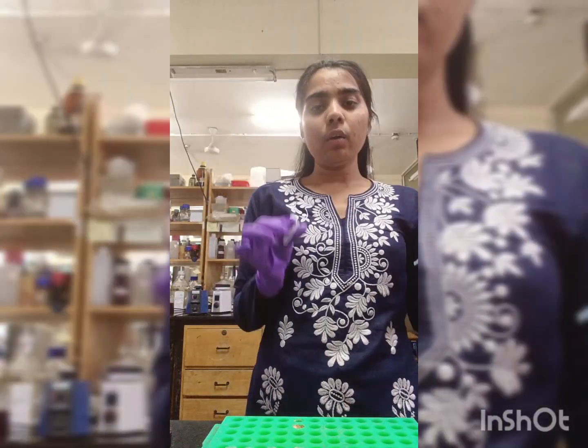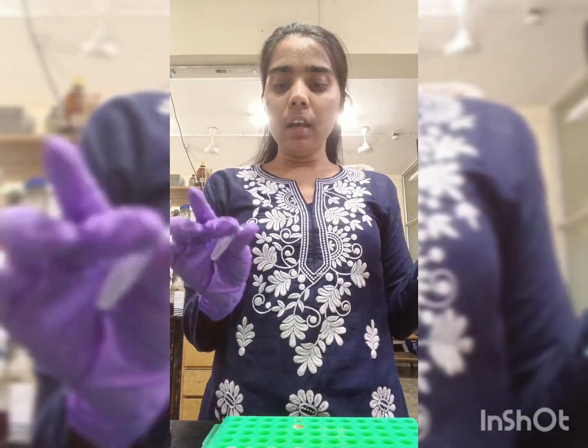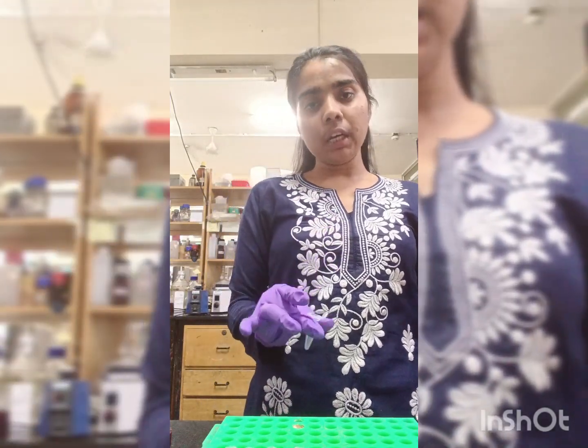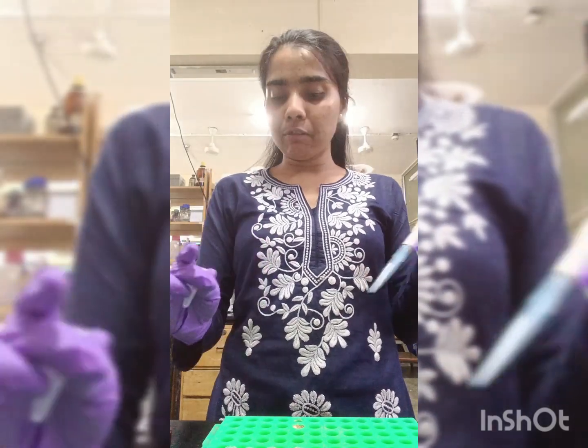So for this experiment I will use this one. First we will take 1 ml of Bradford reagent in each of the tubes. So this is my blank, and I want to check the concentration of 4 different proteins. So for that I have a total of 5 tubes.